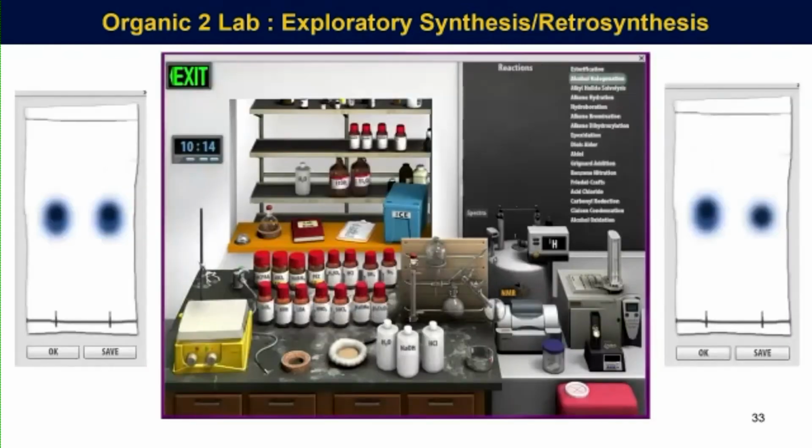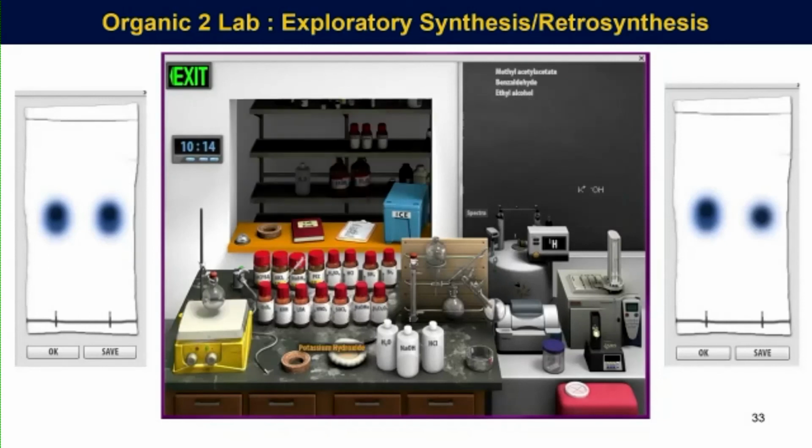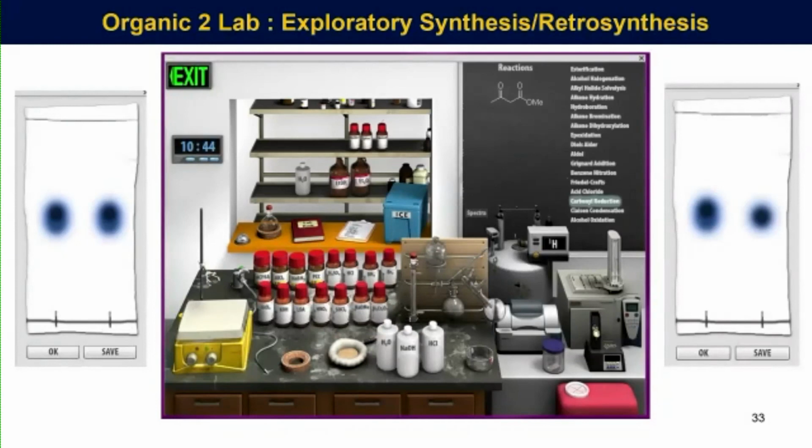So then at the end of that, we can see now they have to choose from the different parts of the chalkboard. They're not guided where they need to go. They go find it themselves. They experiment. If it doesn't work, if you use LDA as the wrong base, it doesn't work. If you use the wrong solvent, it doesn't work. And it took a couple of hours for people to get this all to come together. But the feedback I got was great. People thought it was wonderful because they got to play around, they got to experiment with stuff. TLCs again showing the output, and at this stage now they know how to use Beyond Labs, and they're starting to think like chemists. They're starting to think that sometimes things go wrong, I can fix that, I can experiment, and I'm not just doing what we describe as cookbook chemistry. I'm thinking.